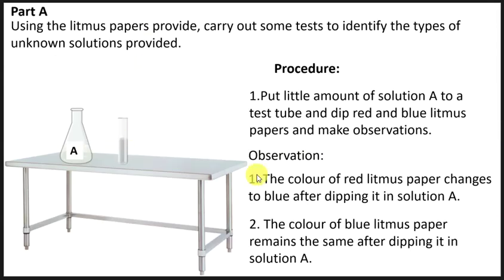Now what we are going to do is go back to the results that we got first for A, where we did the observation.